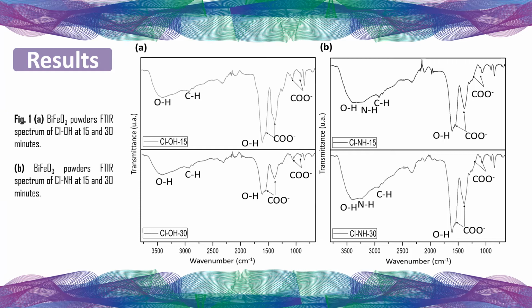We can also observe a signal for the citrate ions, starting with the bands found in the range of 2915 to 2815. These bands are characteristic of a stretching vibration of the alkyl group.